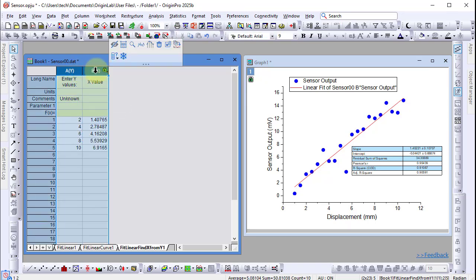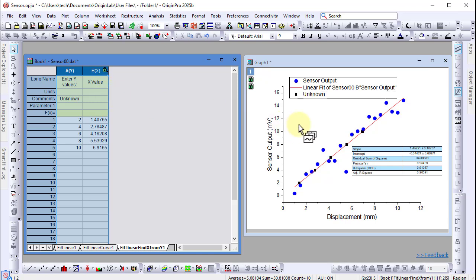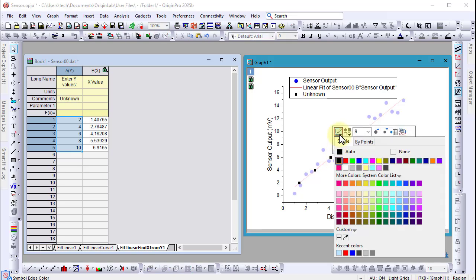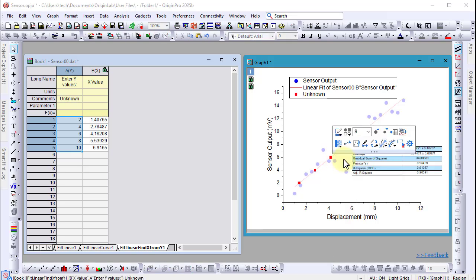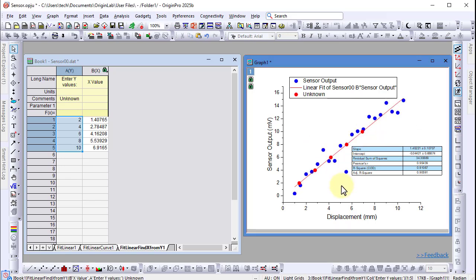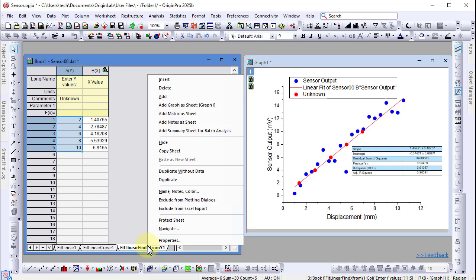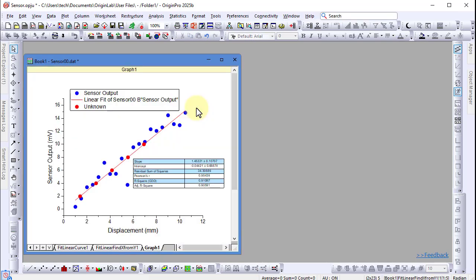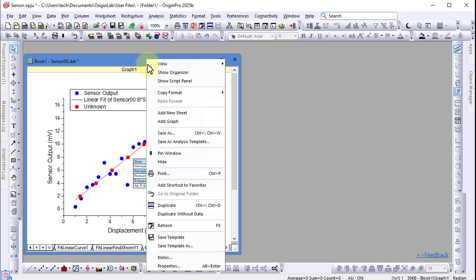Then we can drag this directly into our graph and customize this plot with the mini toolbar. We can quickly add our graph window to our workbook by right-clicking here and selecting add graph as sheet.